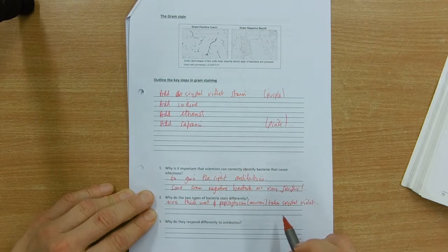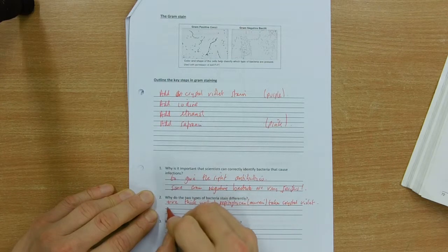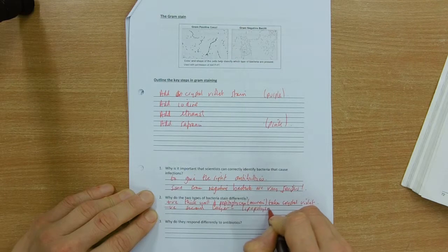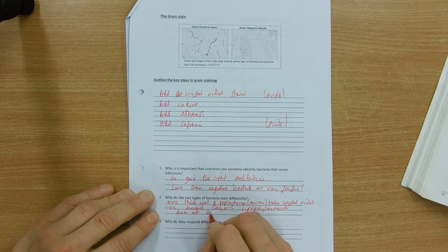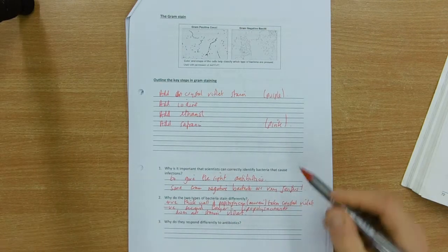Whereas the negative, they've got the kind of standard membrane, but then they've also got a thin peptidoglycan layer there, and then you've got a thin layer of lipoprotein and a second outer membrane made of lipopolysaccharide rather than phospholipids. So negative have a second layer of lipopolysaccharide, and so that does not stain violet, but we'll take up the counter stain of the pink.